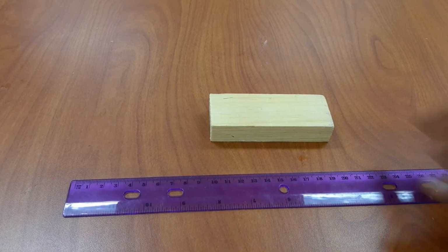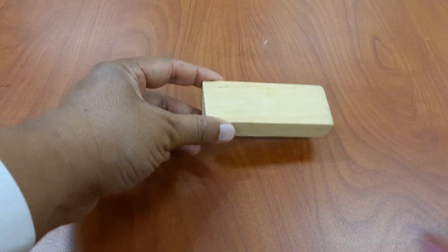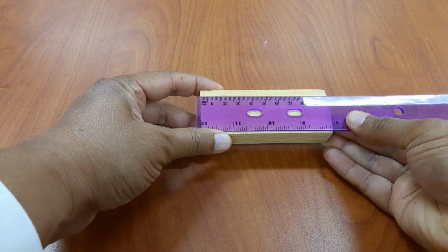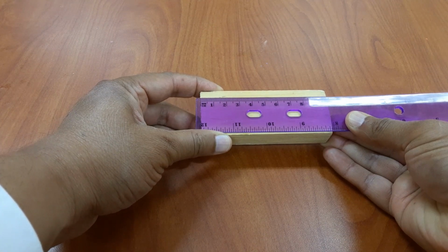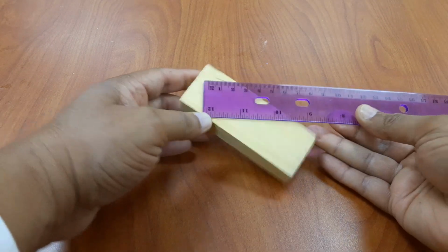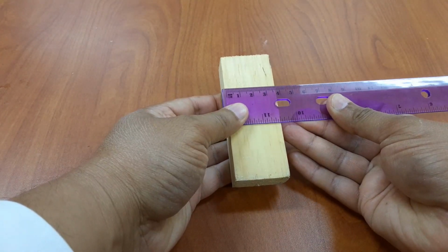So we have a block of wood and we want to find the volume of this block of wood. The first thing we need to do is measure its length. So use a centimeter ruler, and the length of this piece of wood is 9.9 centimeters. Next we want to find the width of this piece of wood.